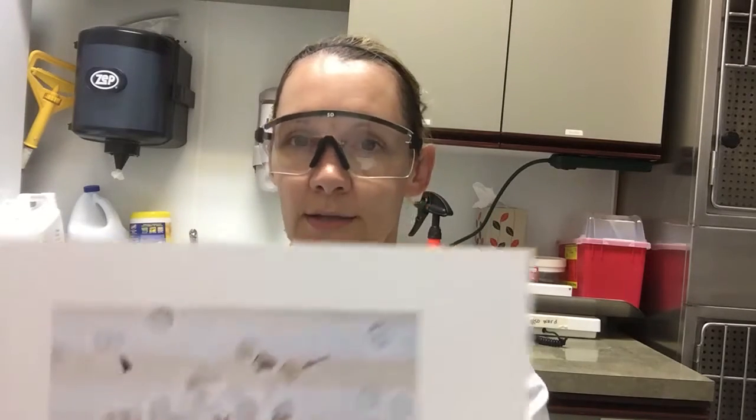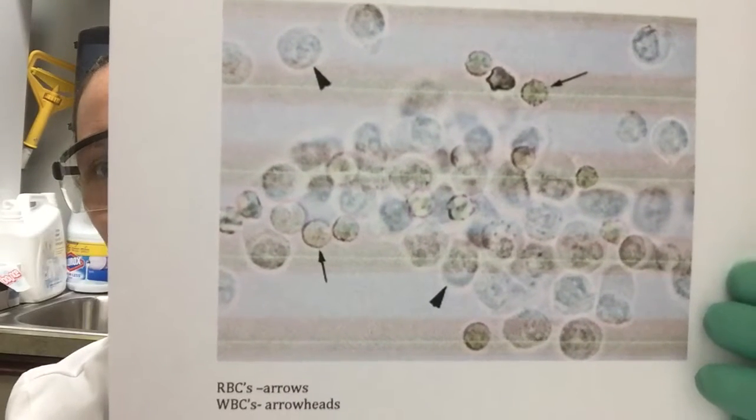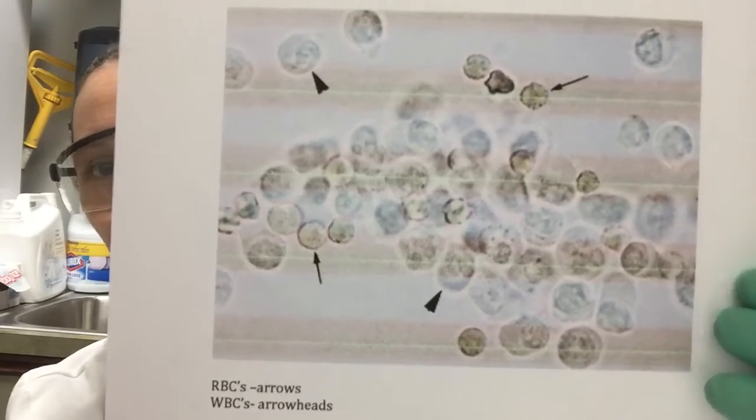Now as far as cells, red blood cells are small and round. They have a slight orange tint and a smooth appearance. Normal urine should contain less than 5 red blood cells per field. Increased red blood cells indicate a hemorrhage somewhere in the urogenital system. White blood cells are slightly larger than the red blood cells and have grainy cytoplasm. Here you can see both of these in these pictures: the red blood cells are the arrows and the white blood cells are the arrowheads.